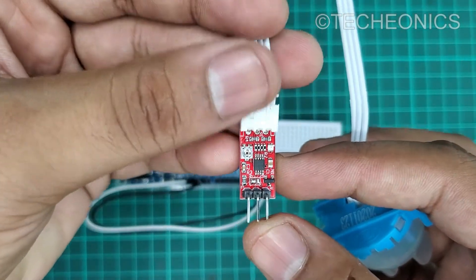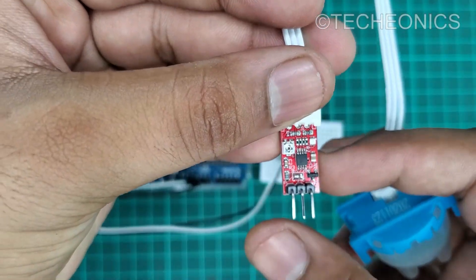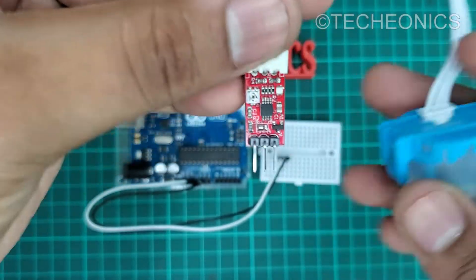Here we have the three pins on this sensor: a 5 volts, ground, and the center one is a signal pin. Let's connect it.